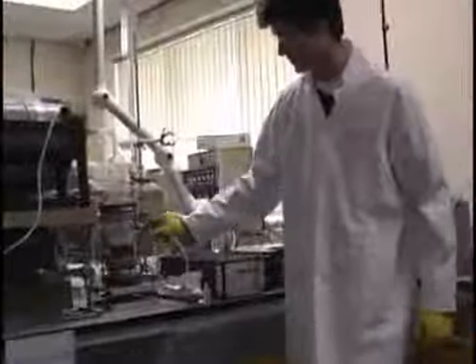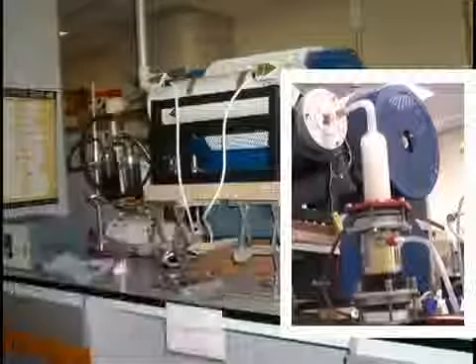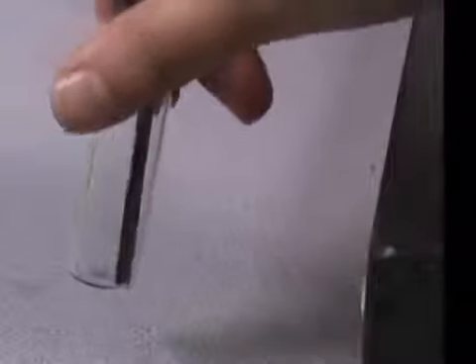A non-reactive gas is passed through the heated solution of the hydrocarbon. The mixture passes through the furnace where the temperature can be from 300 up to 1150 degrees C. He can run the experiment for as little as 5 minutes up to hours in order to get longer tubes. Once the experiment is finished, he collects nanotubes from the soot stuck on the tube sides, and also the base, previously clean, which now has nanotubes all over it.